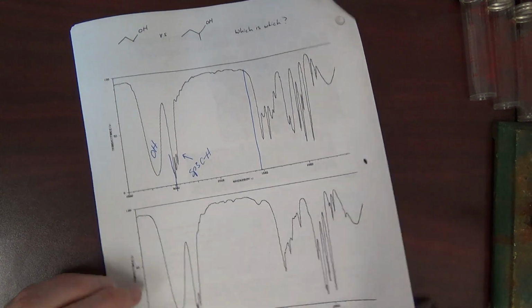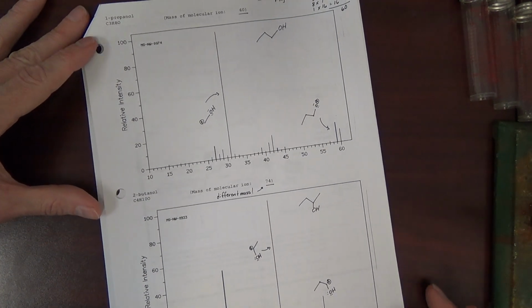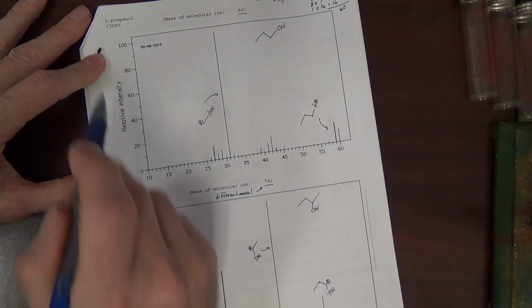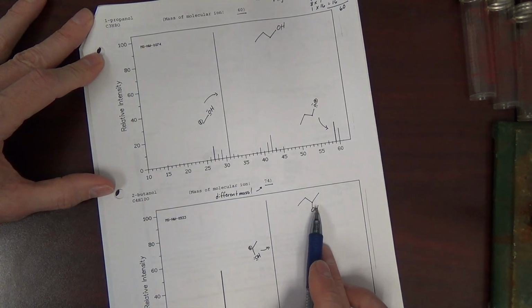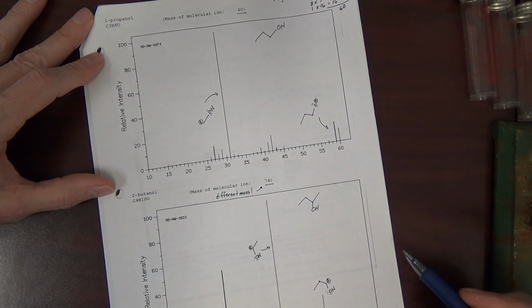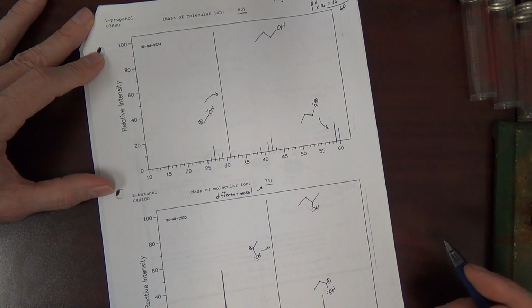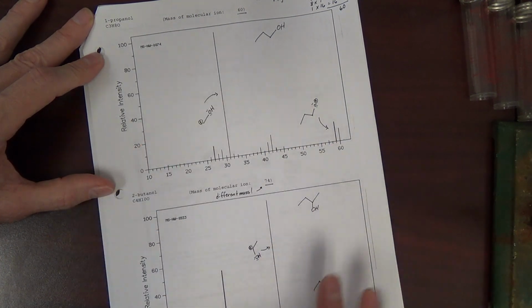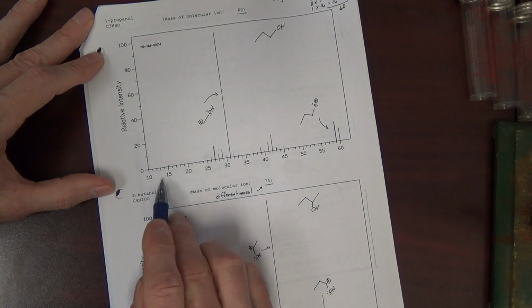Now, on the other hand, if we look at the mass specs, these are the mass specs of each compound. One of them is called 1-propanol. Here's the structure here, and the other is 2-butanol, 4 carbons total. We'll eventually learn how to interpret these, but this is just to show you the mass specs here at the beginning.